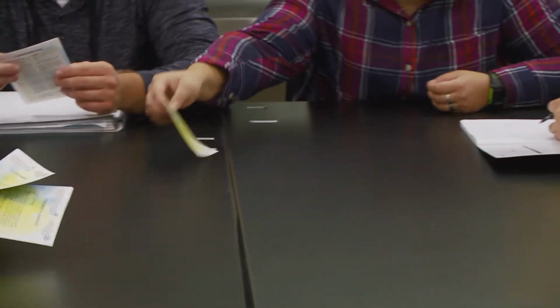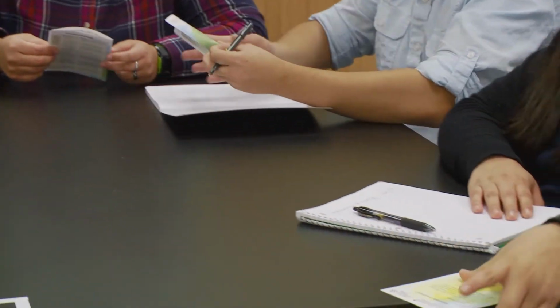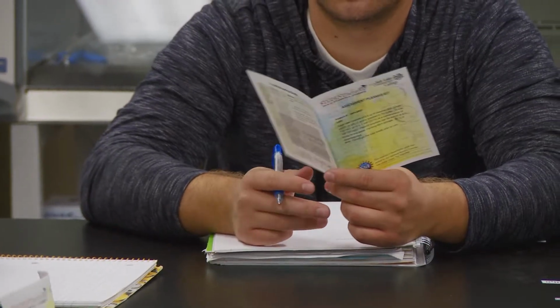The challenge that we have is this design team is we're going to be figuring out what we would like those plasmids to look like. So think about what things you have to have in a plasmid. We want to make our plasmids all the same size, but we also want to incorporate some unique features in them. Our students get a hands-on experience actually making a product based upon the skills that they've learned in the research.